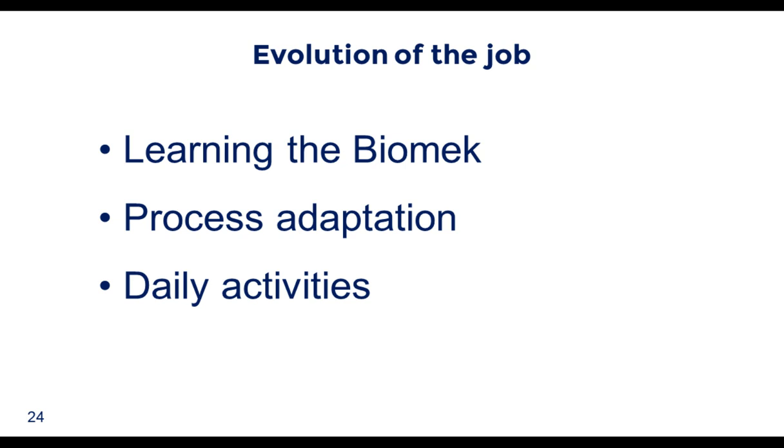The first step is, of course, learning the operation of the liquid handling platform. From there is the process I've described of adapting your process to automation. I've mentioned a few lessons learned in the process, such as not needing to tip a plate during certain aspiration steps. It also caused us to look more closely at each step, particularly in regards to scale-up timing, as this can be scheduled with process management software. Through all this, your daily activities have evolved from pipetting to programming. Let's look a little closer at each of these points.